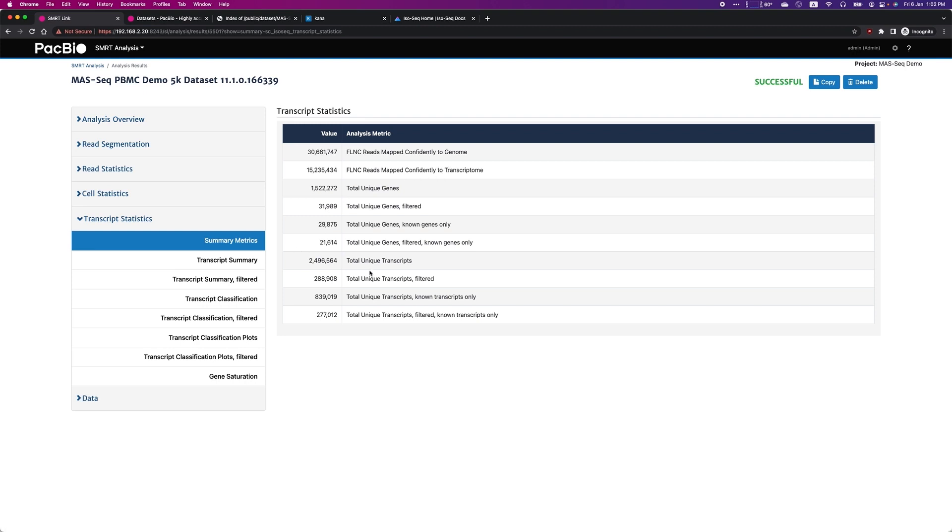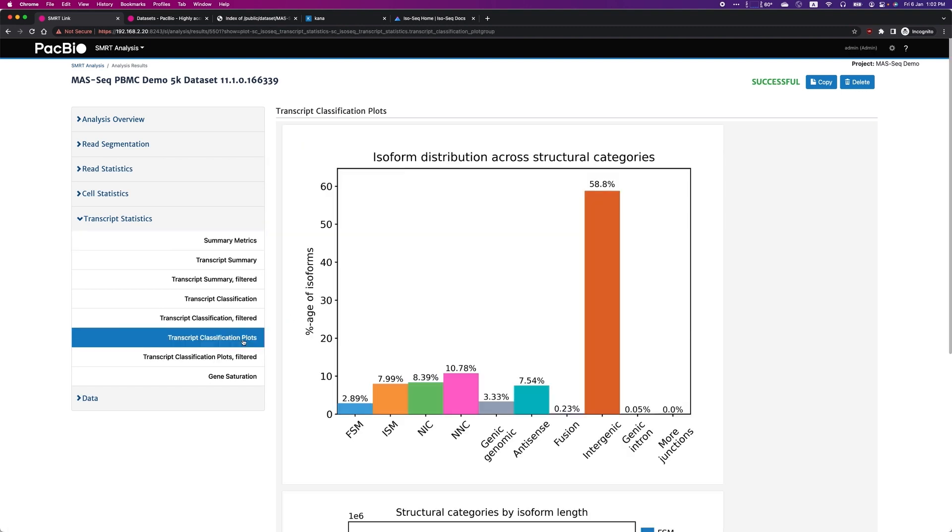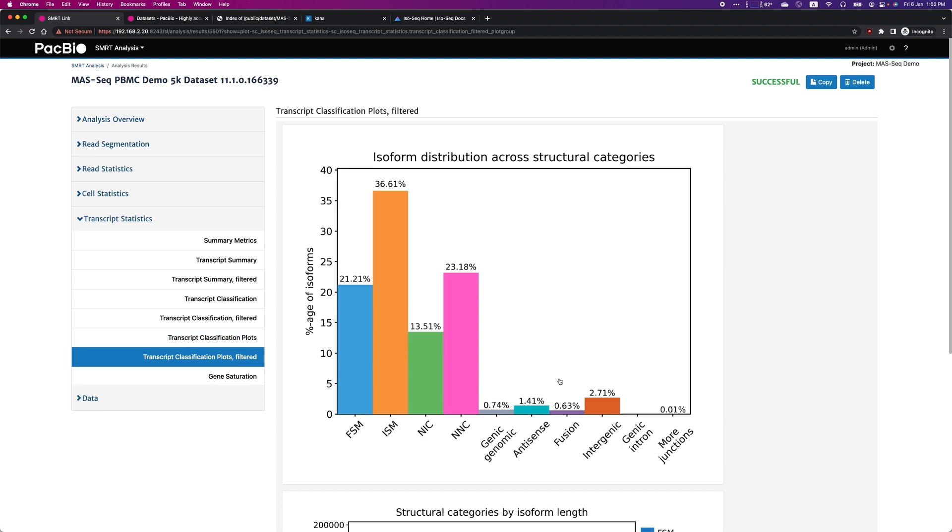If you look at the transcript classification plot before filtering, you will notice a high percentage of intergenic transcripts. For example, after filtering, these likely artifacts are removed.